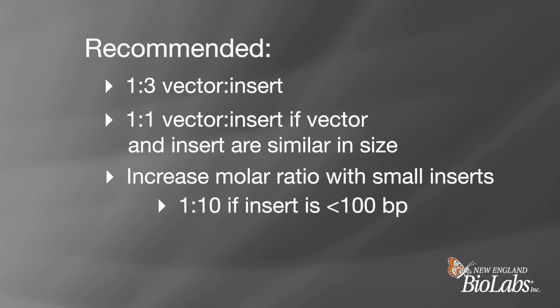If the insert size is 100 base pairs or less, then you may consider using a 1 to 10 vector-to-insert ratio. If you are cloning an insert that is a couple dozen base pairs, then a 1 to 20 vector-to-insert ratio may be more appropriate.